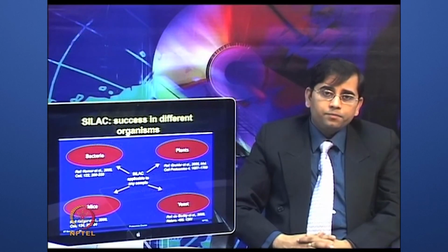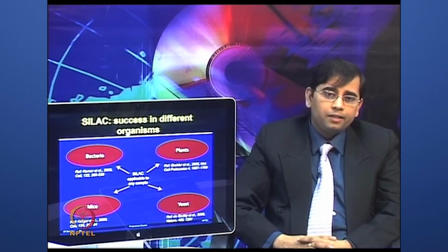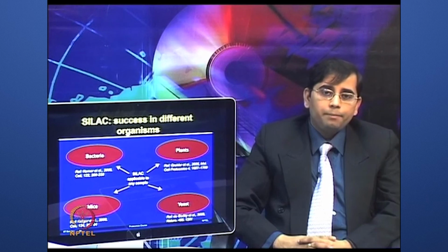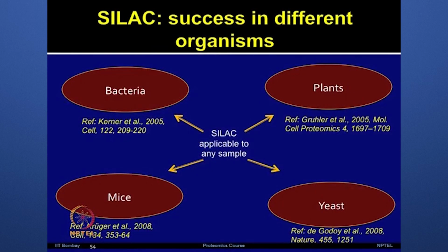Interestingly, the SILAC method has now been used in different organisms, in bacteria and in yeast. These were the more commonly used because of the ease of growth in cell culture, but there are some studies on Arabidopsis in plants as well as in mice, which have shown that SILAC can be applied to a wide variety of organisms.